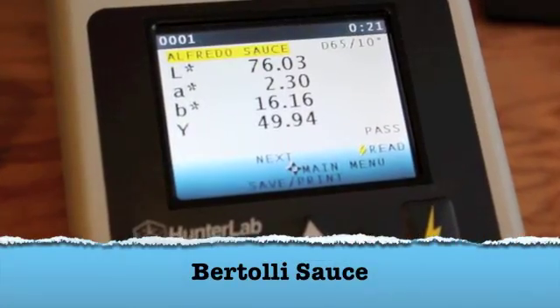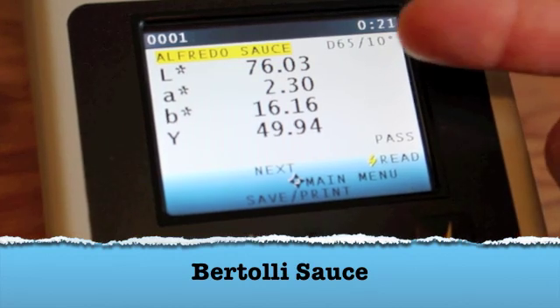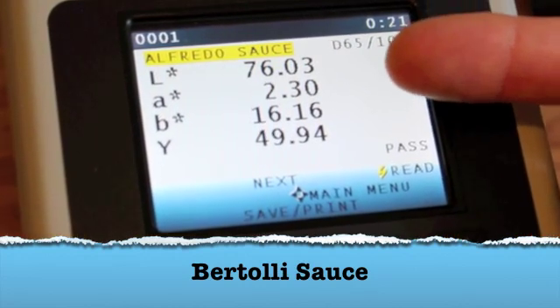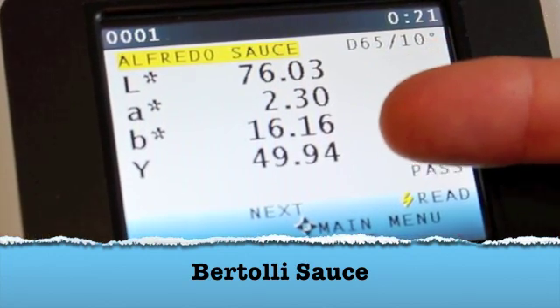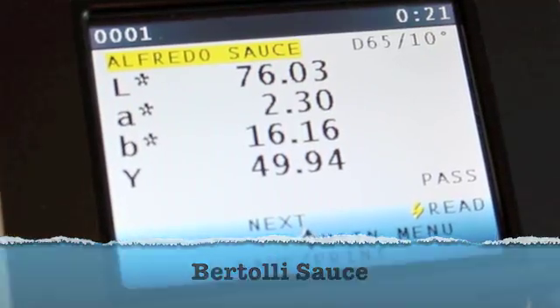In this example, we're showing a light product with an L value of 76, an A value of 2, which shows a slight redness, and a B value of 16, which is a yellow product.